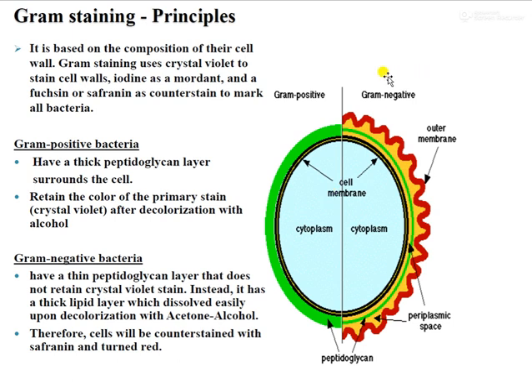Just remember, I'm giving you a code: though it is considered gram negative, it has something extra. Though it is considered gram negative, it has an additional feature. At the cellular structure, the cell wall has another structure called the outer membrane in addition to the peptidoglycan layer. Now, this green color showing over here is the peptidoglycan layer. In gram negative organisms, the peptidoglycan layer is very thin, and it also has an additional outer membrane.